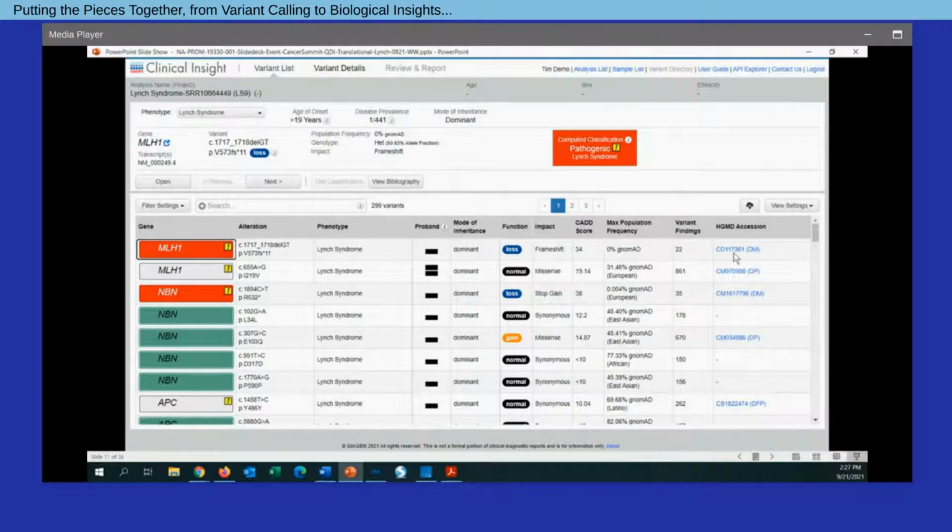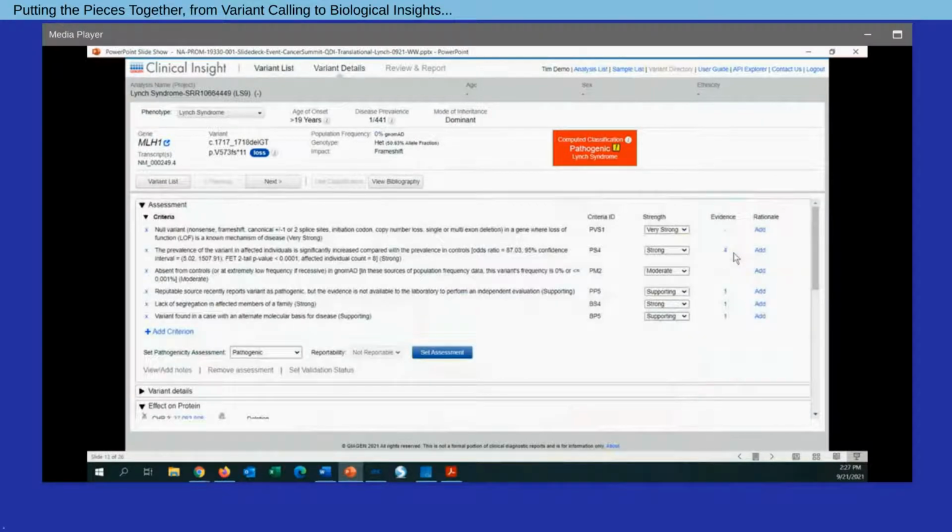Now, from this table itself, for any variant of interest, we have the ability to come in and look at the different pieces of criteria that were used with the ACMG guidelines to generate a classification of this variant being pathogenic. And so again, here we're focusing on what I showed in CLC, that deletion in the MLH1 gene. We can see there are various criteria that have varying degrees of strength that would suggest that this variant in these samples is pathogenic.